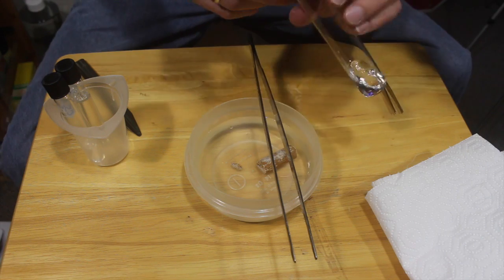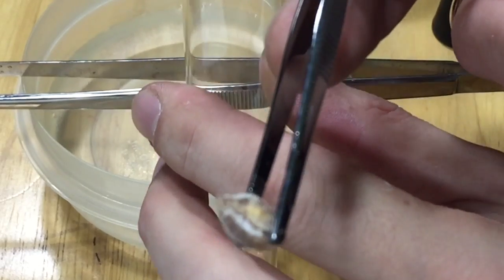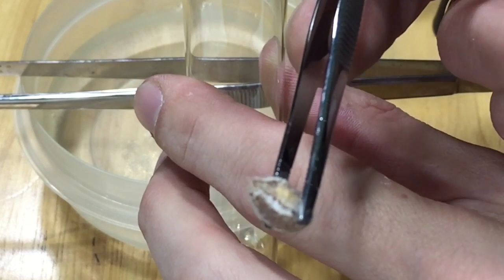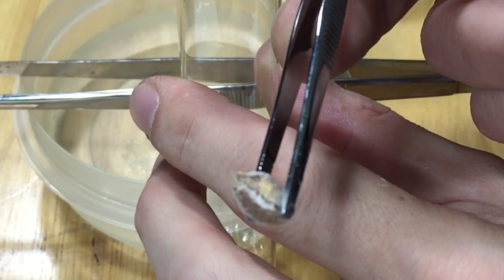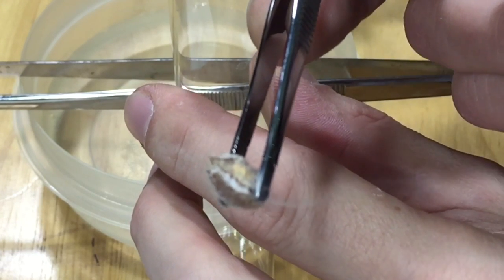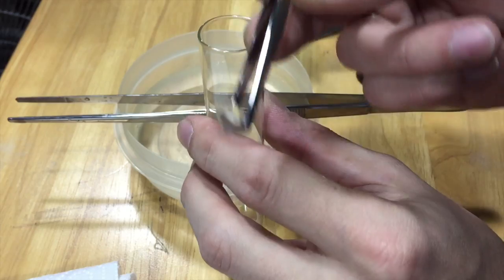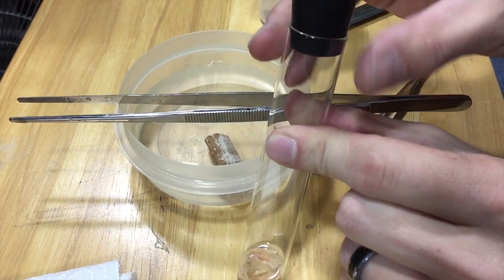Now we've got some carbon disulfide in our tube and we just need to add the phosphorus. There's our piece of phosphorus — you'll notice it actually starts smoking once you've had it out for just a second. You can see the smoke rolling off of it there. That's not really something that we want to breathe, so we're gonna go ahead and drop that in there and seal our tube back up.